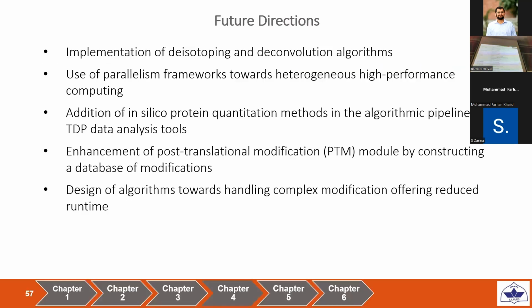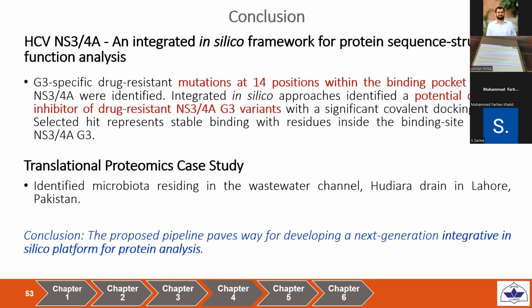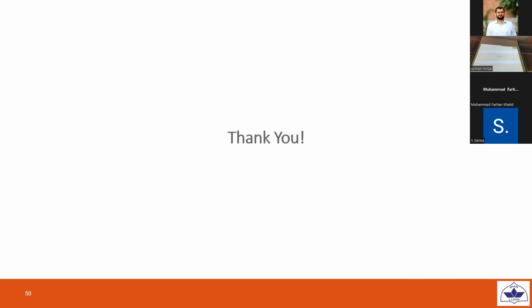So I had my reservations because when you use the words de novo sequencing using proteomics platforms, there are lots of other issues and concerns. For example, there are a couple of amino acids which would show you exactly the same mass and hence confuse the overall output. Similarly, a dipeptide, a Gly-Gly, is going to give you the mass of asparagine.